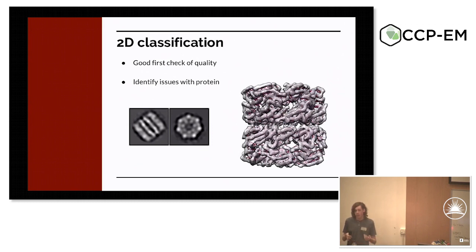So what that allowed them to do was see this quickly, even build a rough kind of 3D model within hours of their data collection starting, and then they could go, oh, what have I done? And they could go back to their lab book, back to their gels, realize that they hadn't purified it maybe as well as they thought. They could stop their data collection and then save valuable microscope time, which was then freed up for other users in the facility.